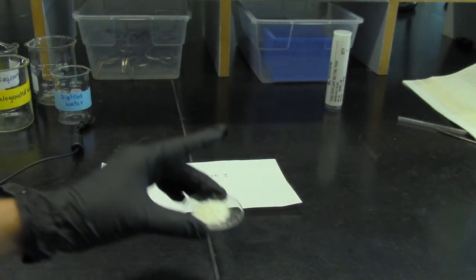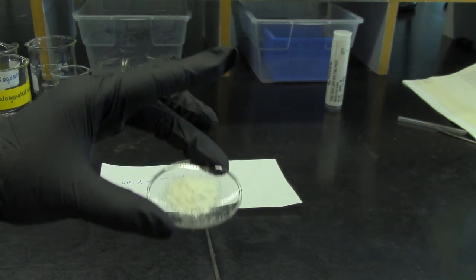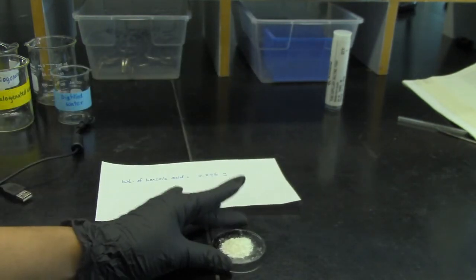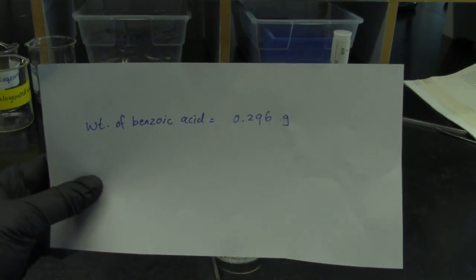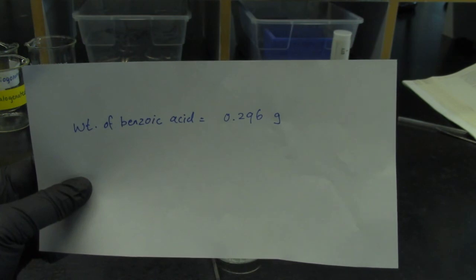Okay, from here you can see the oven-dried benzoic acid. See the white powder? Yeah. Okay. And the weight of benzoic acid is 0.296 gram. Okay, from here you can calculate the percent yield.